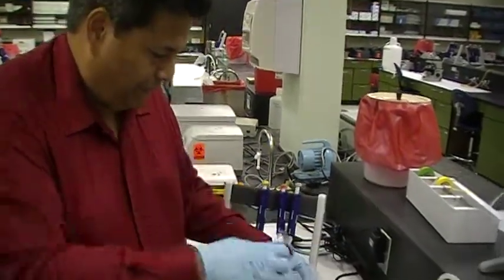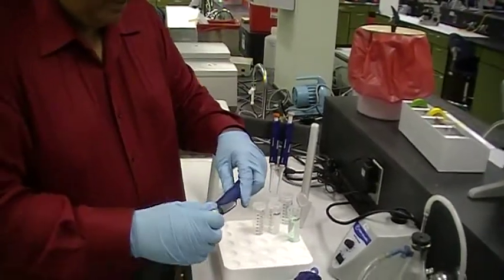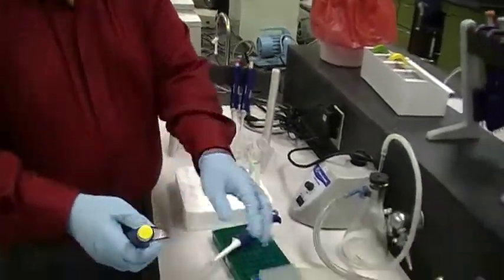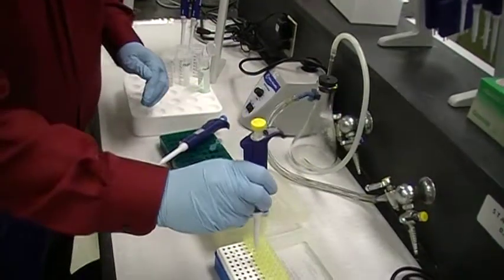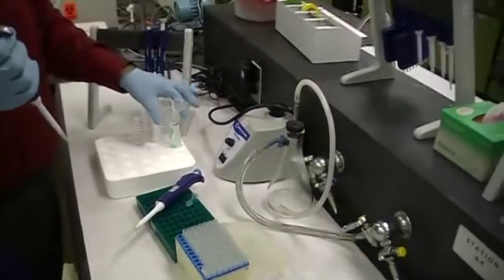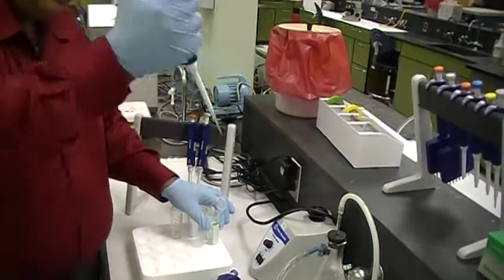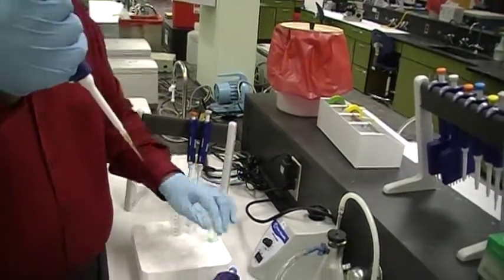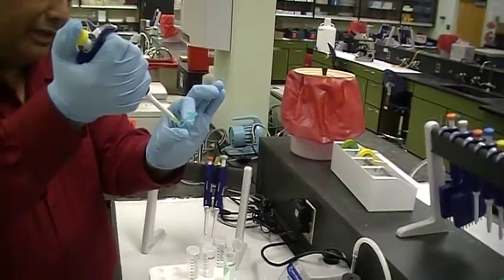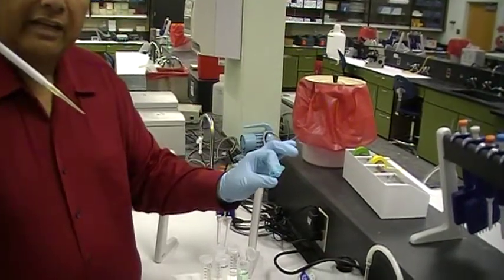Same thing with the smaller pipettes. Take the P200 and dial it to 100 microliters — that's how much we're going to measure. Open up the yellow tip box and put a tip at the end of it. Go down to the first stop, guide it up — that's exactly 100 microliters. Pick up the destination tube, put it in, and slowly eject it, going past the stop. Take it out.